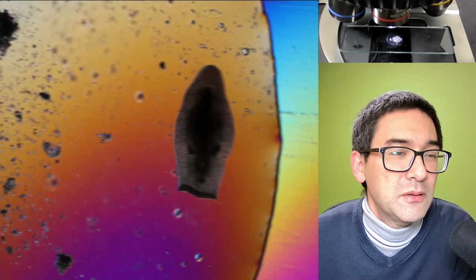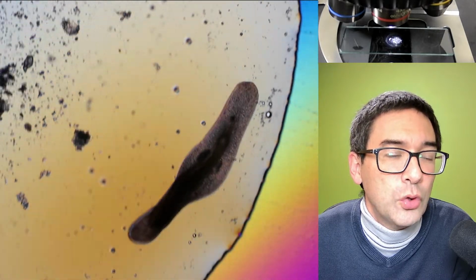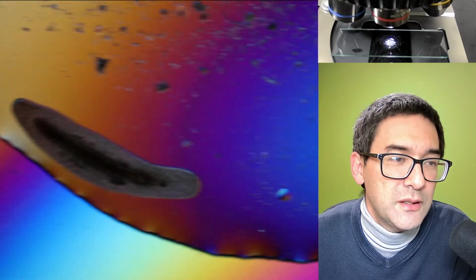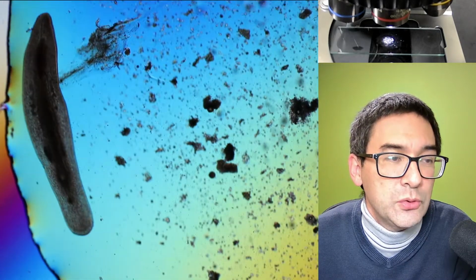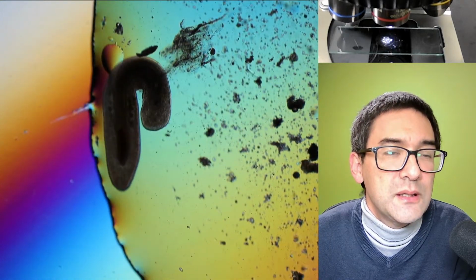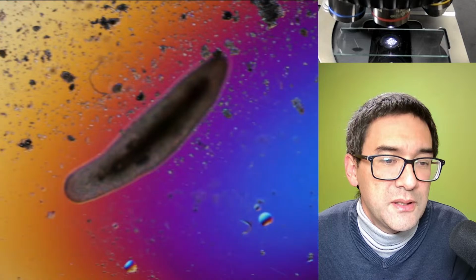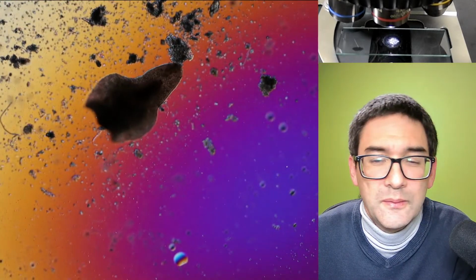And with this flatworm, what I was hoping to see is whether there is a certain antimicrobial effect. Flatworms are strictly speaking not microorganisms, but generally, because the chemical structure of the molecule is such that it is able to disrupt cell membranes, single-celled organisms can essentially pop open when they're exposed to this spicy substance. And look over here, this nematode worm really doesn't care. Yeah. So, yeah.